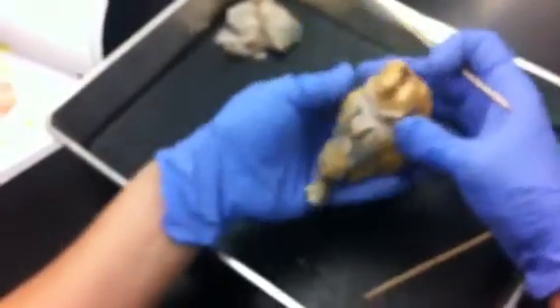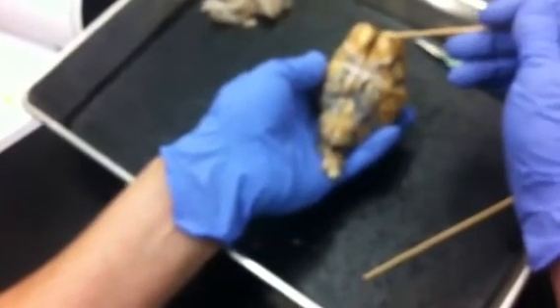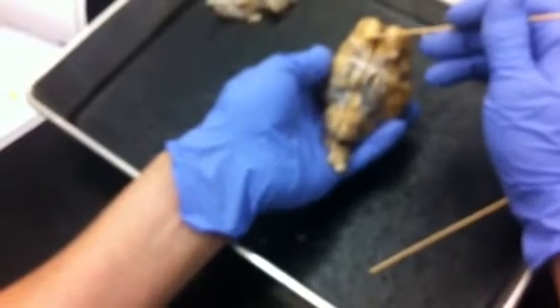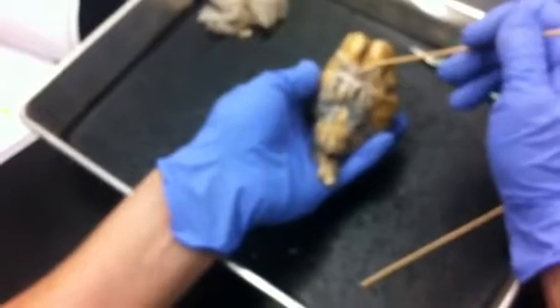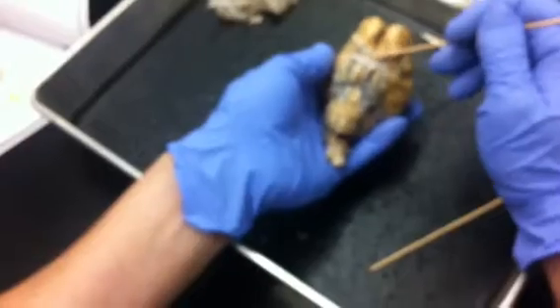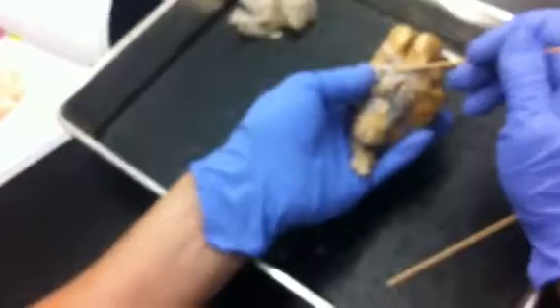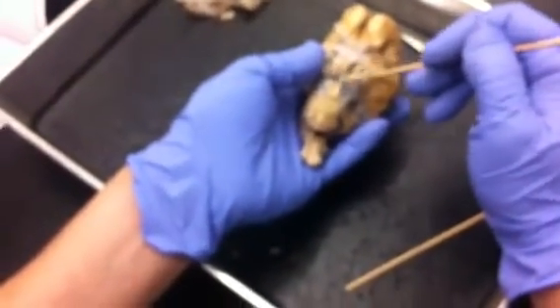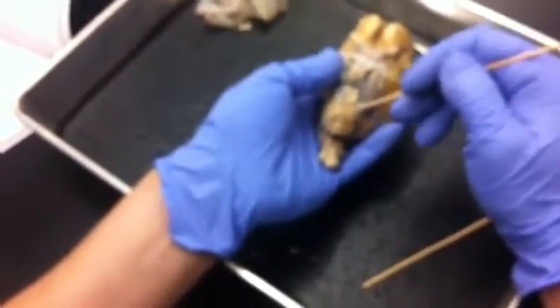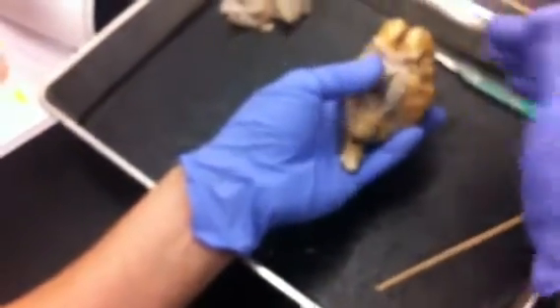Okay. If we flip it over, you've got your olfactory bulbs, the olfactory tracts, optic nerve coming from your eyes, where it crosses, optic chiasm, continues into the optic tract down there, pituitary gland, pons, medulla, spinal cord. Okay, if we open it up.